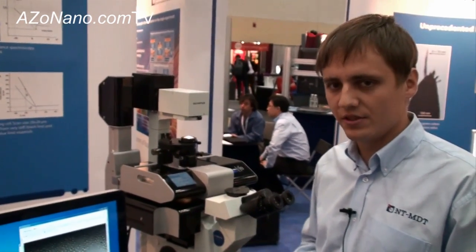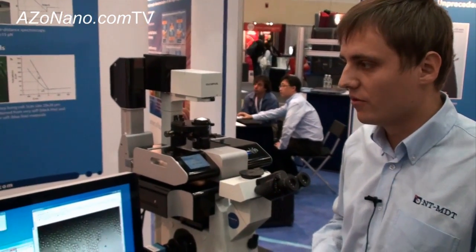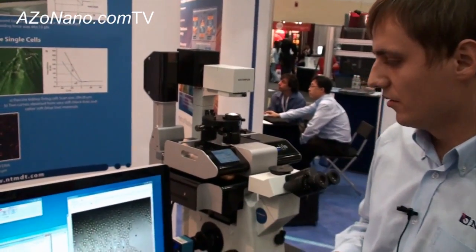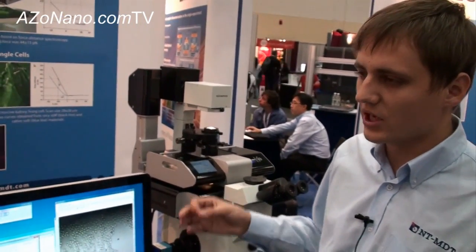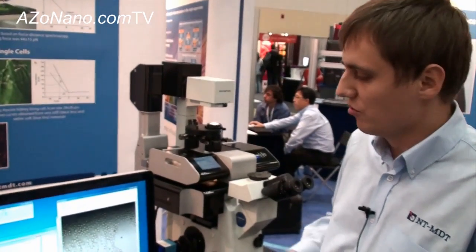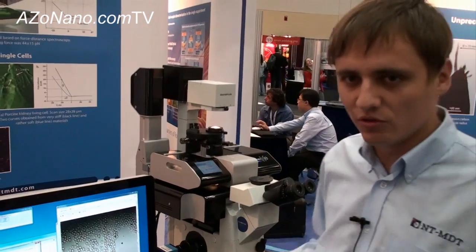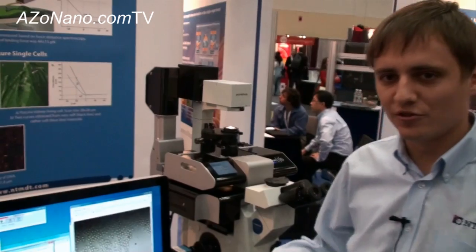What sort of samples do people look at under this microscope? From my experience, usually people who deal with different kinds of cells, bacteria, or down to biological molecules. So this is actually a universal tool for nano-biology.